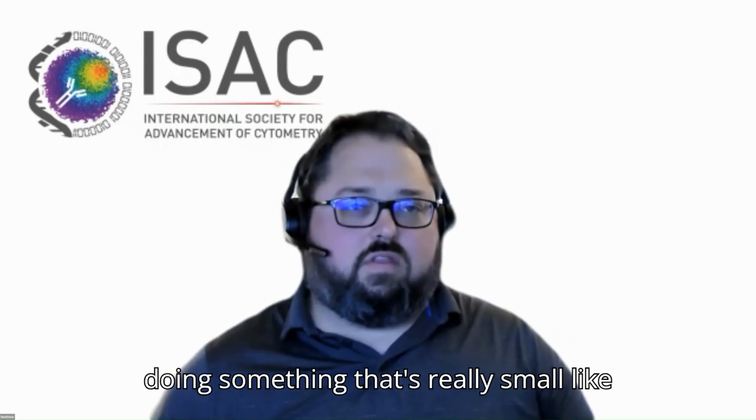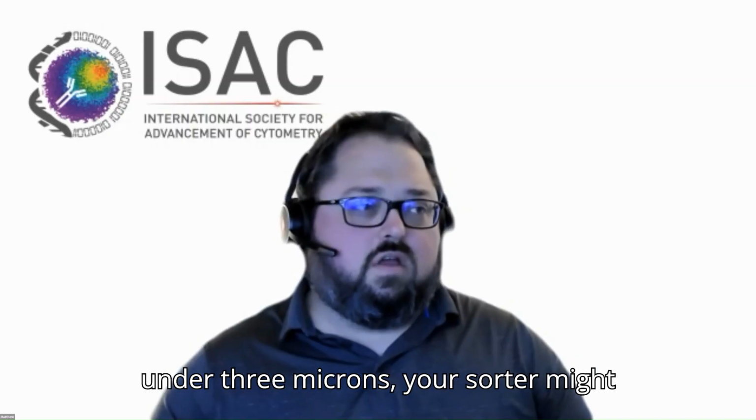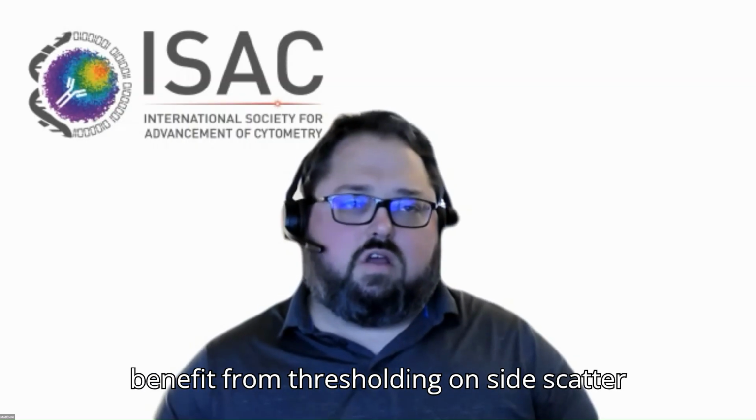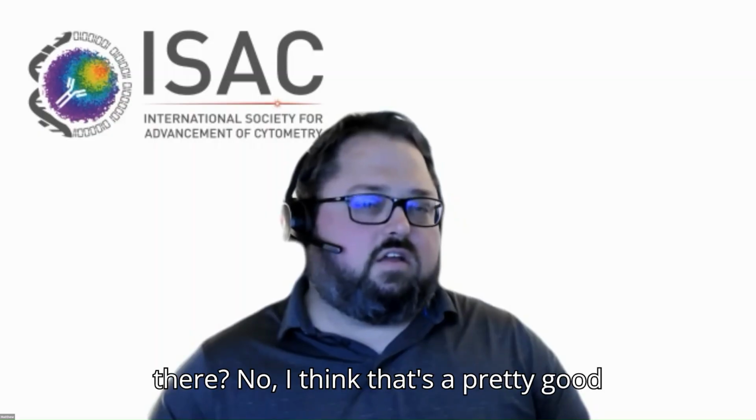If you're doing something that's really small, like a bacterial sort or a yeast sort, something under 3 microns, your sorter might benefit from thresholding on side scatter and using that as your trigger channel. Steve, do you have anything you'd add there?